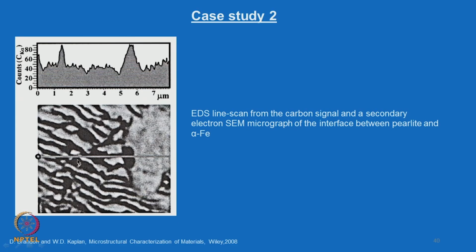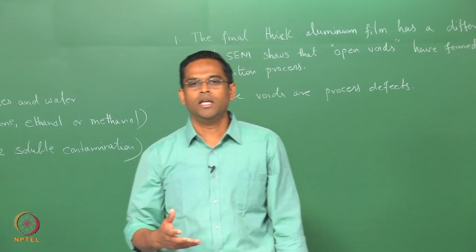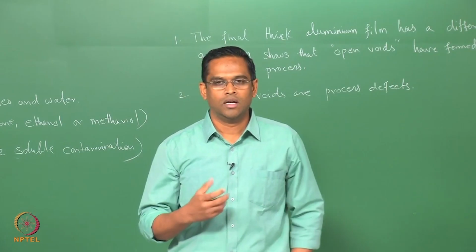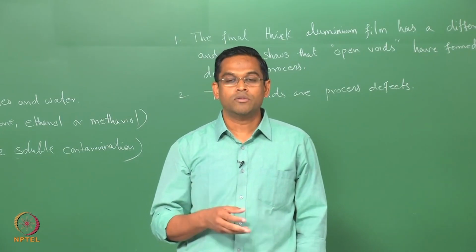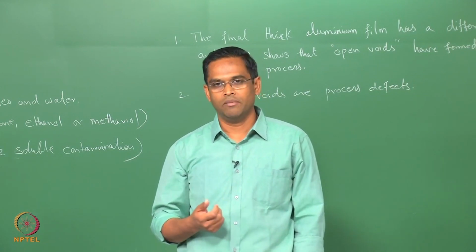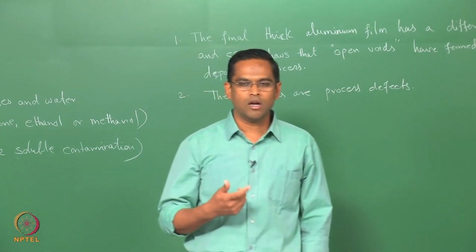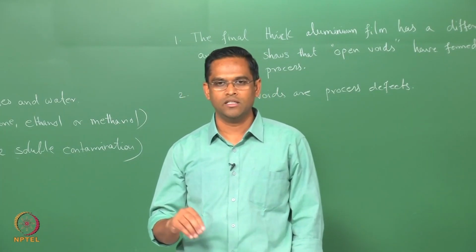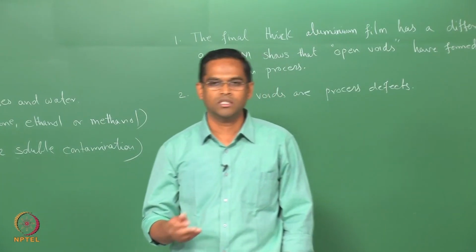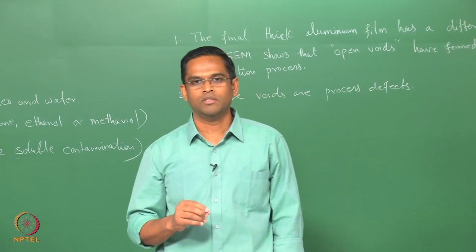So, when you do this EDS analysis, you may find some chemical elements which may not be seen in a secondary electron image like this one. So, in order to confirm that, you need to do this analysis in 2-3 regions or as many regions as possible to confirm the presence and identify the elements which are present here.